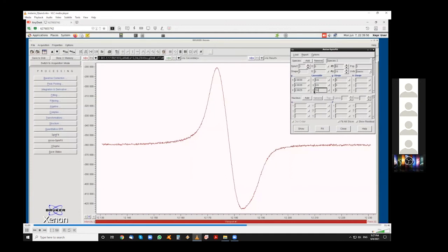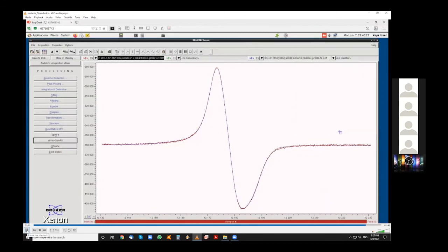And after completing everything, we will fit the result, and it's almost a good simulation. We will check all the boxes to optimize all of our parameters. And in the end, after a little bit longer, you observe that the time to process the information is a little bit longer now that it already has two centers. So this is our final result, which is very good.